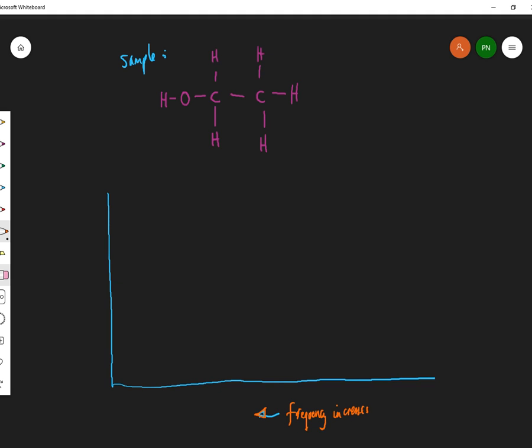I'll have to be with you and show you the paper moving in front of you, because it's not complicated at all, but it's just one of those things. It's very visual. So the frequency goes that way, and on this side we have the absorbance. How much is absorbed? Now we'll talk about these numbers later, but let's have a look at this.